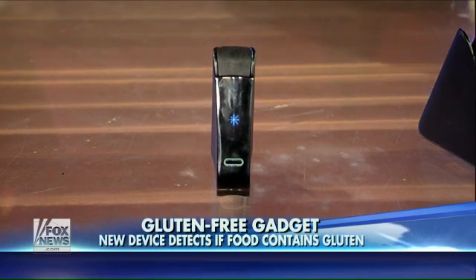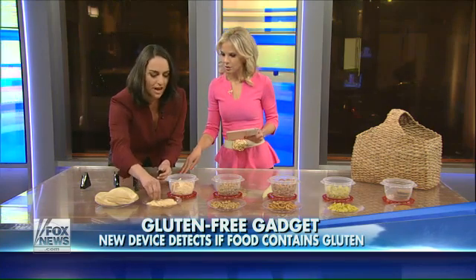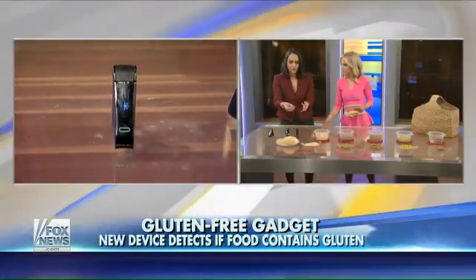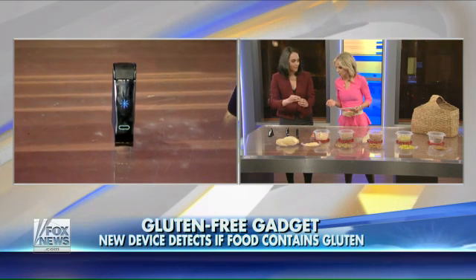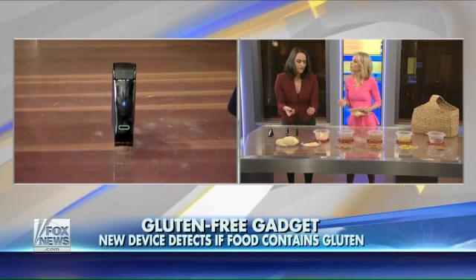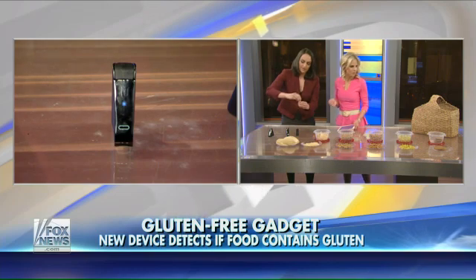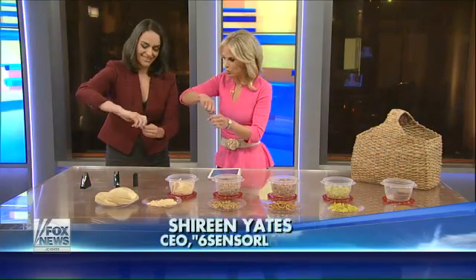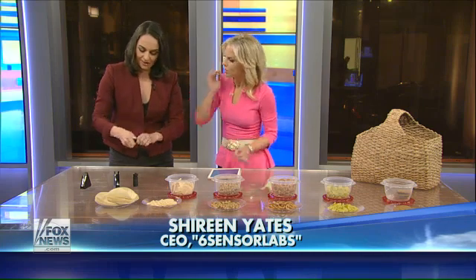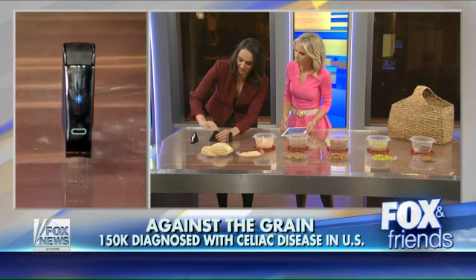So while that's cooking up, we're going to do a demo just to show you, just because it takes a few minutes. If you're eating out in those uncontrolled eating environments, you're not sure — they say it's gluten-free, but you want a little extra data beyond the menu or even beyond what people say. We spent about two years developing this chemistry-based detection. You take a sample of food, put it in this disposable capsule — you're actually crushing it almost like a screw right into the hole — then you turn the capsule all the way and place it in this sensor. In a few minutes, you know yes or no.